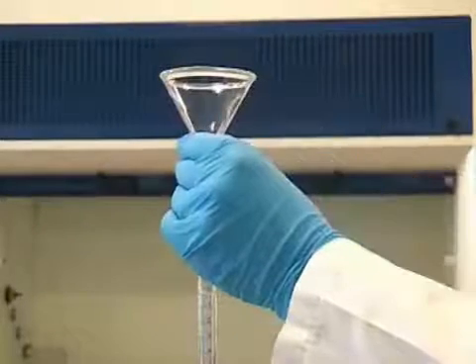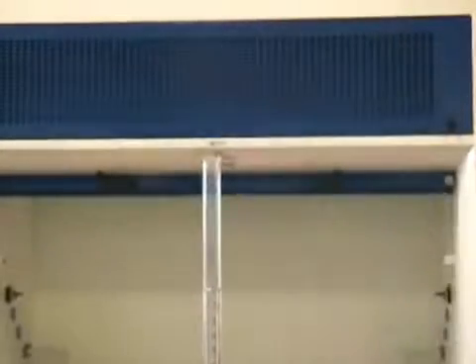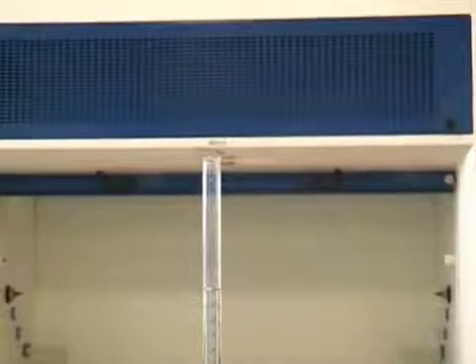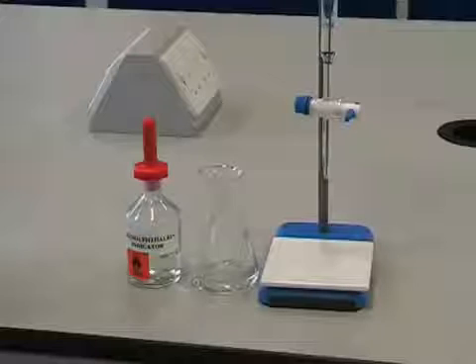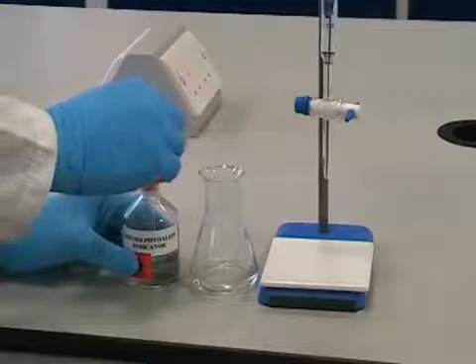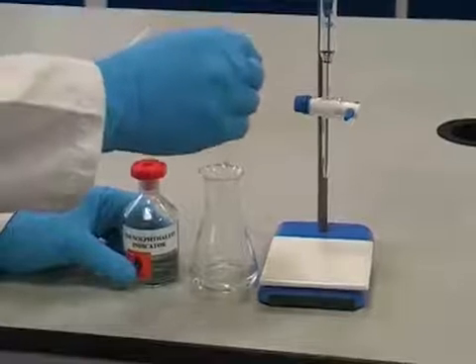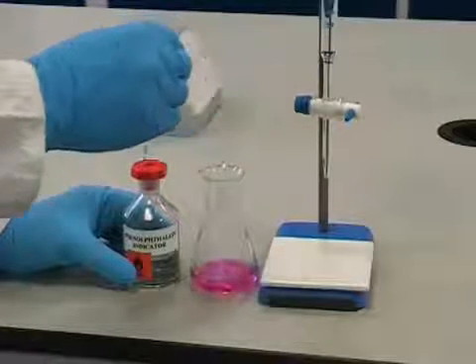It's not essential to fill the burette to the 0 line, although you must make a note of the burette reading for later on. Before carrying out the titration, we need to add a few drops of indicator, which in this case is phenolphthalein. It's important not to add more than 2 or 3 drops of indicator, as you don't need it.